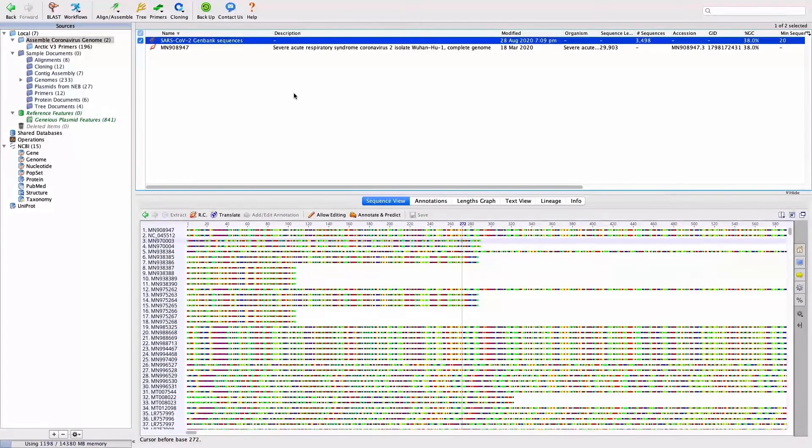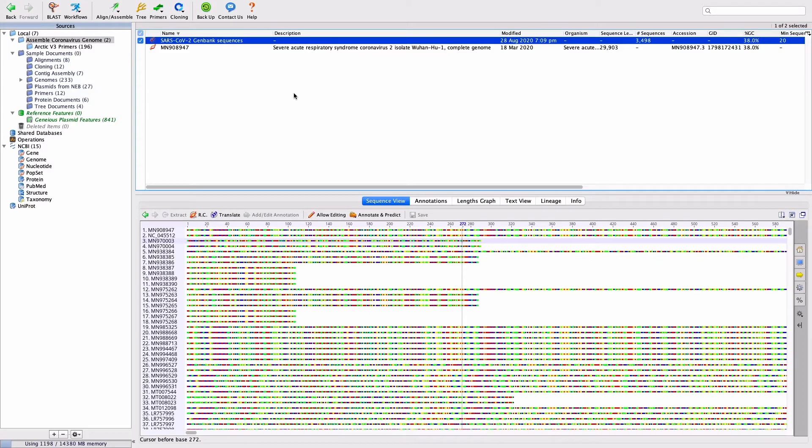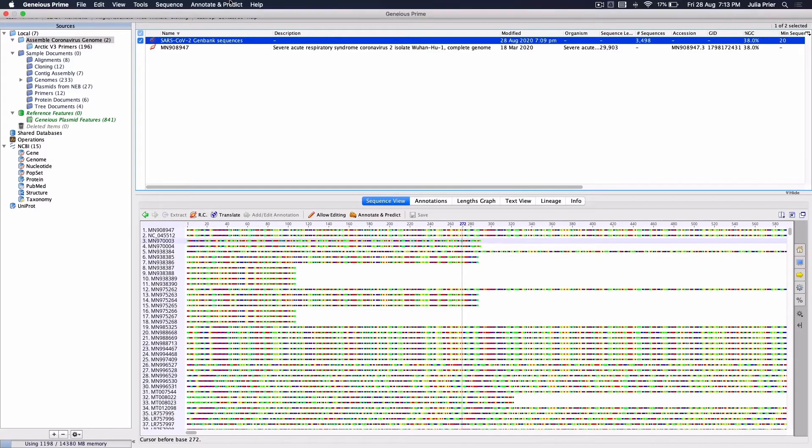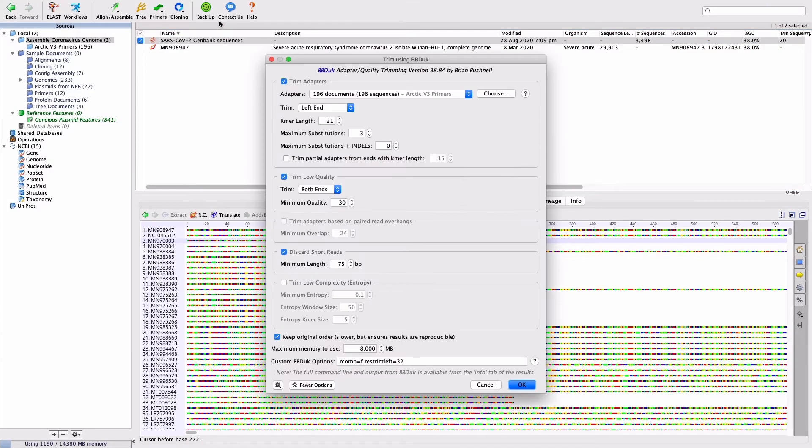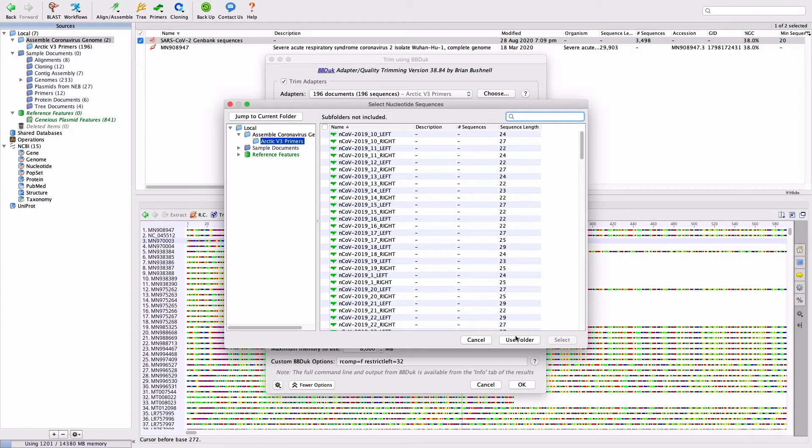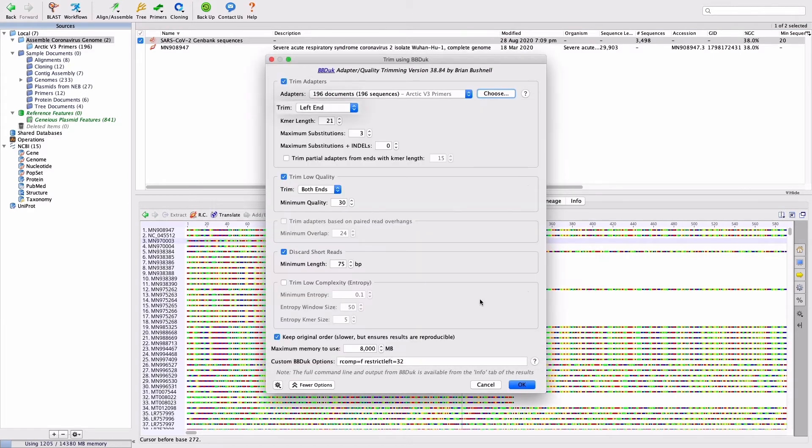Once your primers have been imported into Geneious, open BB Duck by going to Annotate and Predict and Trim with BB Duck. Under Adapters, select the folder containing the primer sequences and set Trim to Left End.